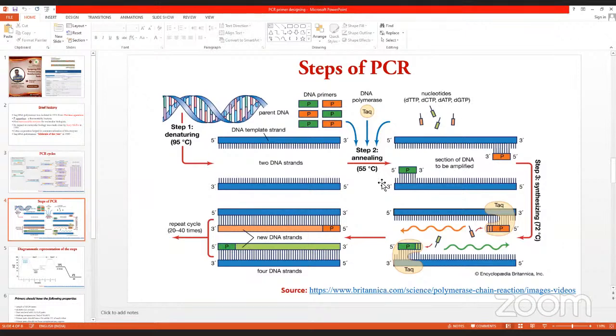But during PCR, at this step, you will be able to put only a single temperature. So for one primer the annealing temperature is 56 and for another it is 62, then what temperature will you set at this step?